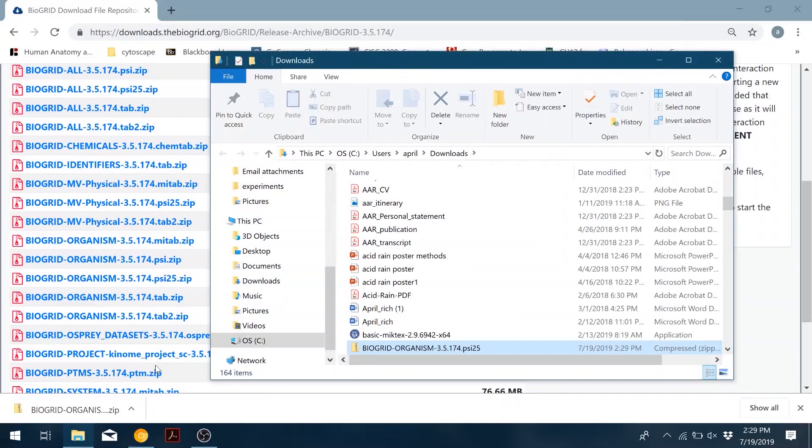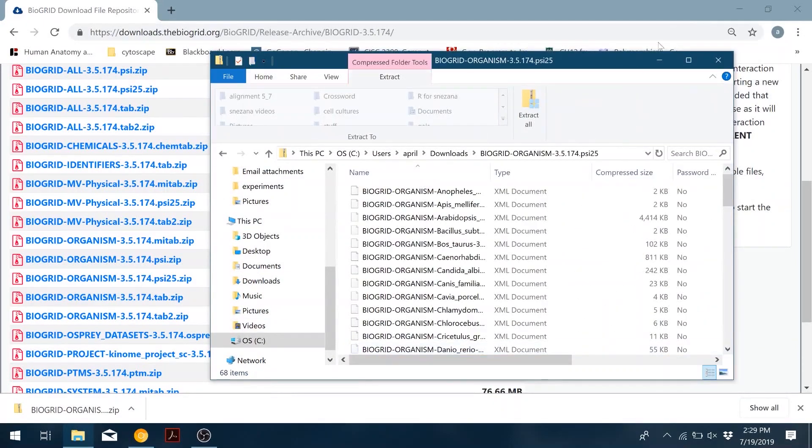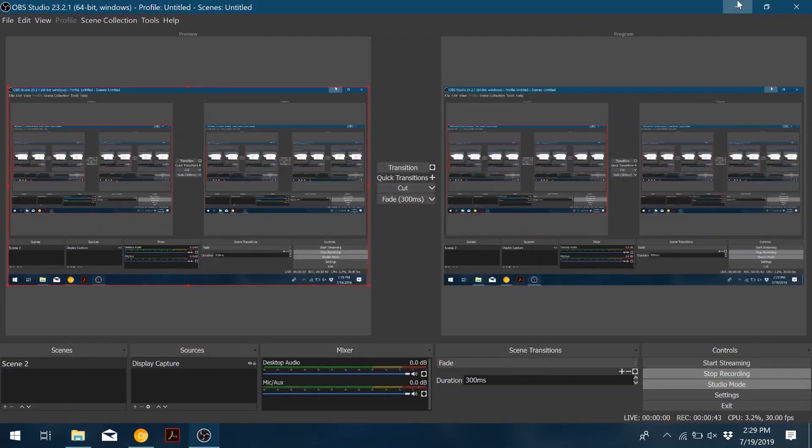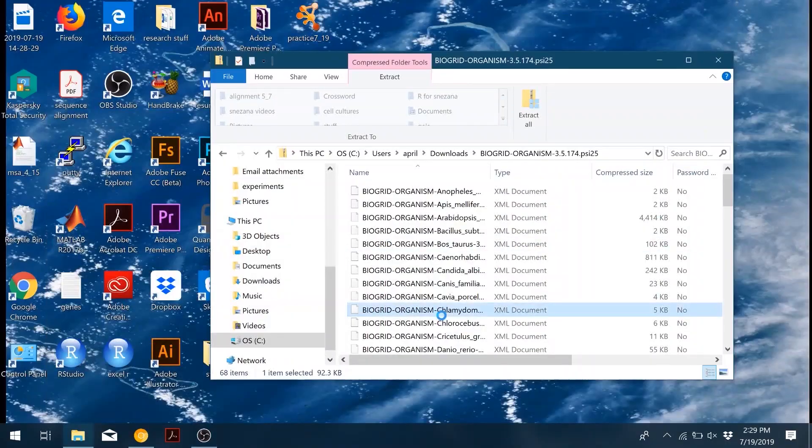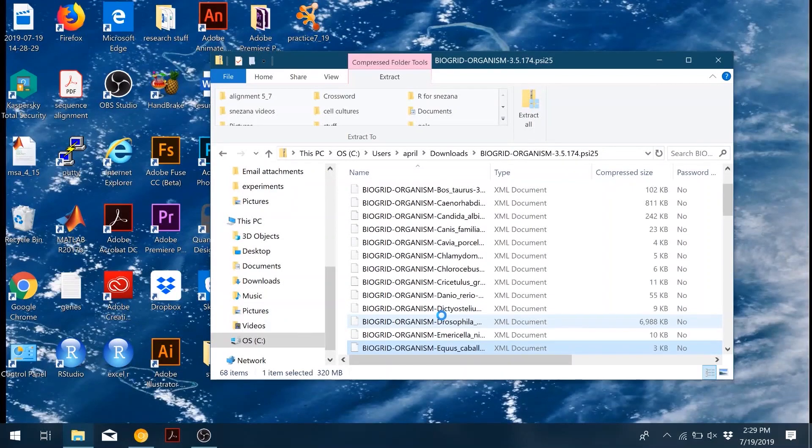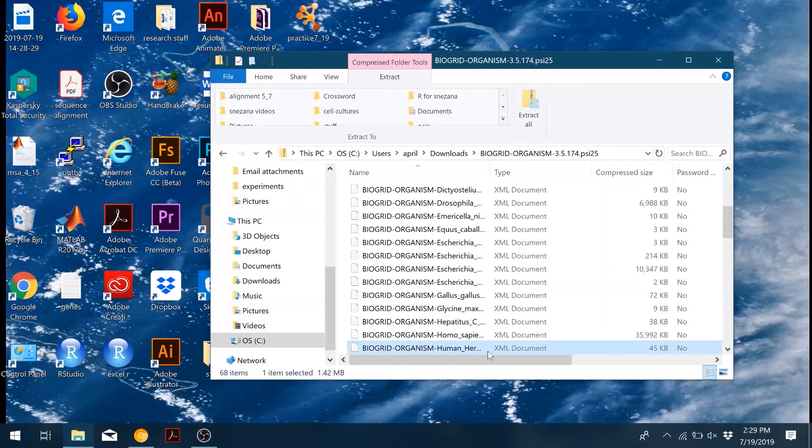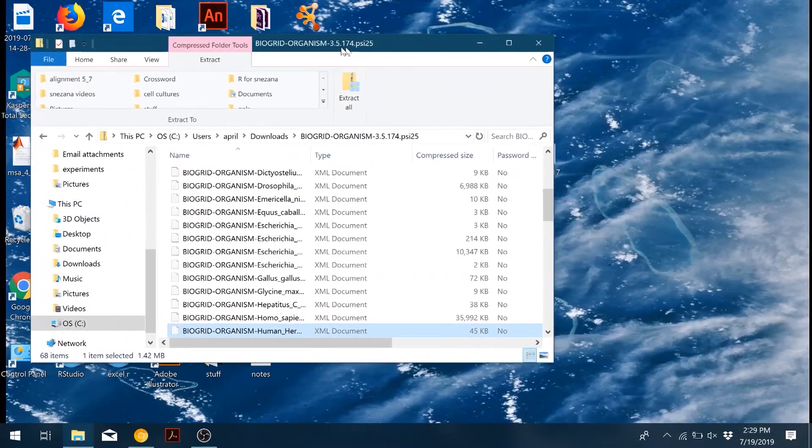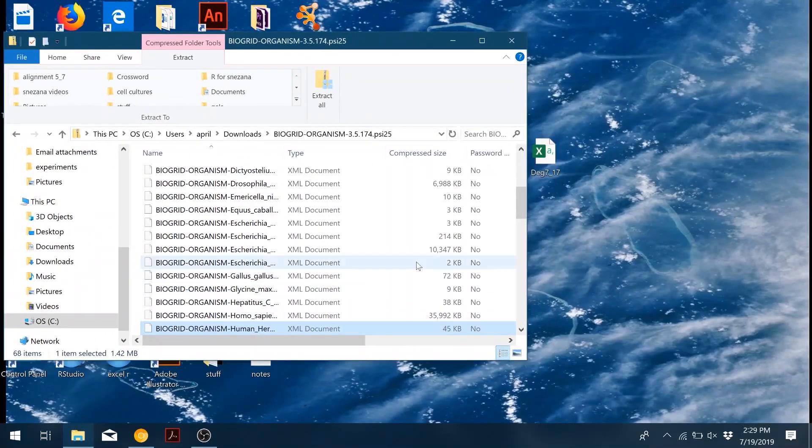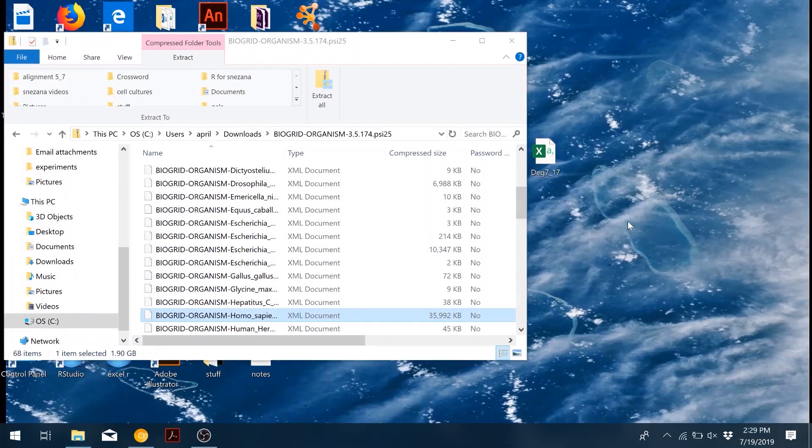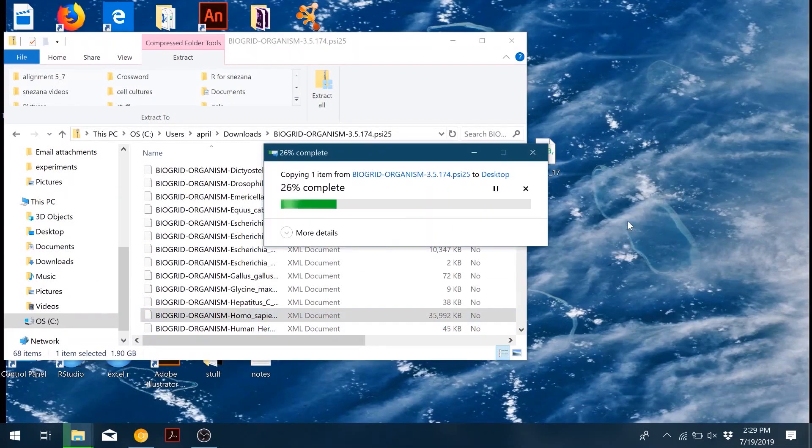Once it's downloaded, go ahead and open the compressed folder, and then find the organism that you will be using, which in this case we're using humans, and then copy it to somewhere you can find.